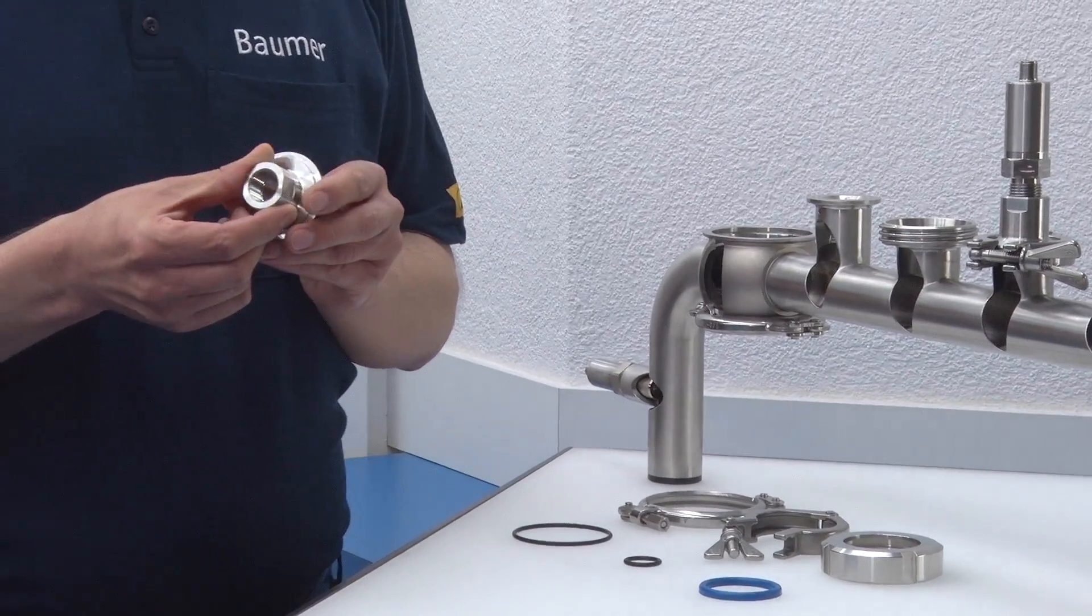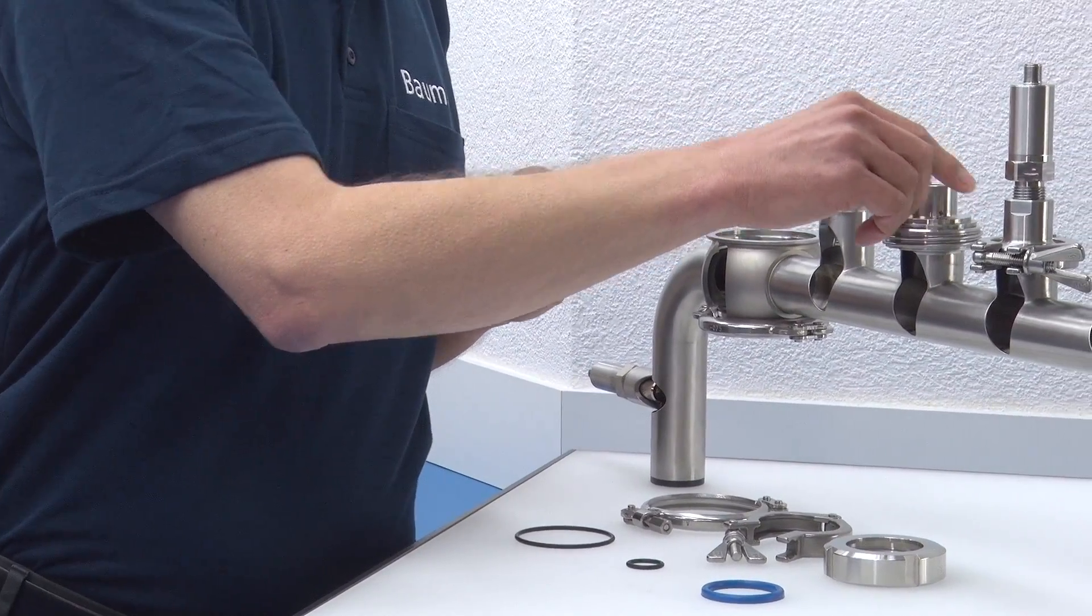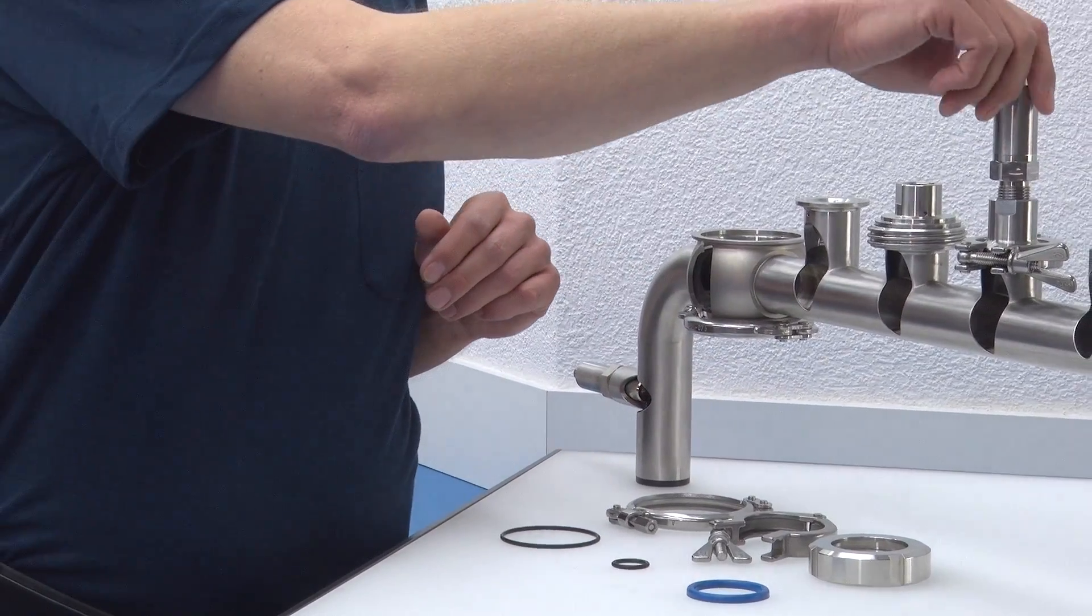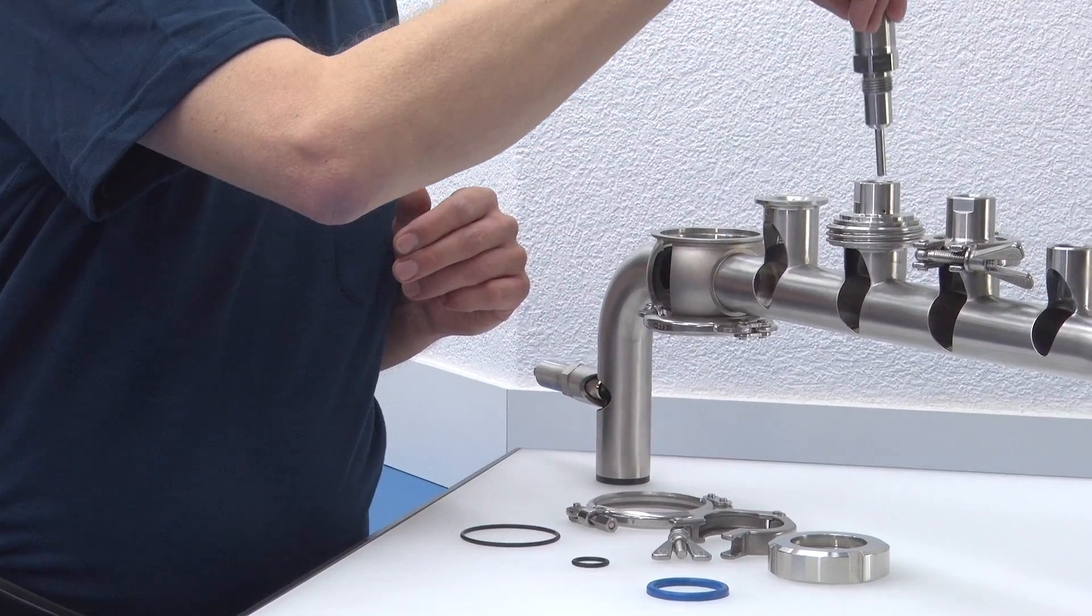Such adapters are also available for Dairy Pipe Connections. I do not consider any mounting accessories here to keep it simple.